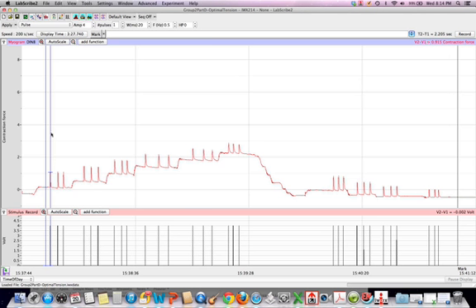So what I would do is just write that number down physically, and then move this over, and then get the next one. That's close to the top there. And that's pretty close. You can use a little cursor button, or the arrows to kind of get it lined up there. Okay, 0.885, and then you can get the next one there and continue on. And you add those up and you can get the average for this particular length.